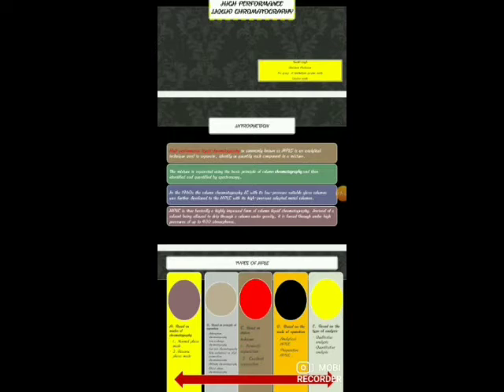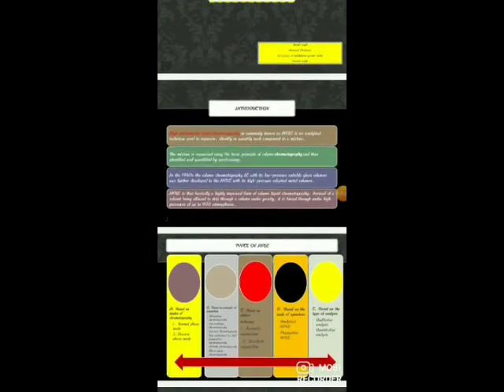Means we add in the mobile phase acidifier, basifier, buffer solution for better separation, because it will neutralize the ionized analyte or ionized compound present in our column, so separation will be better. So it's all about mobile phase.